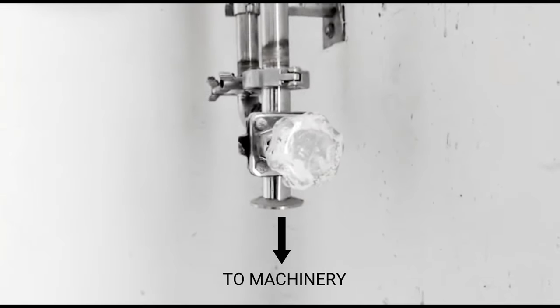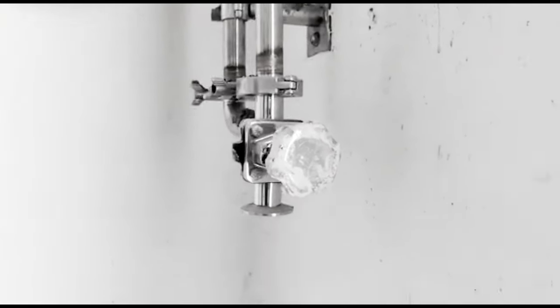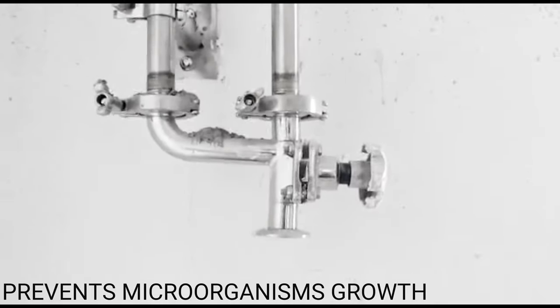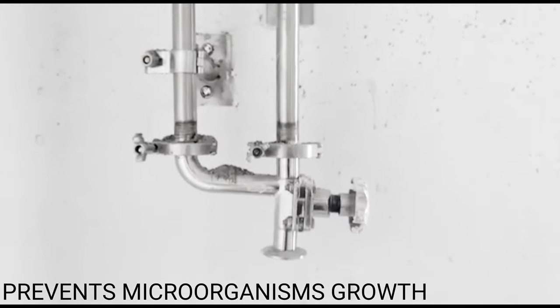The loop system is used so that water doesn't stop anywhere in between and is in continuous flow, so that there is no chance of microorganism growth in the water distribution system and proper pure water is supplied for the production purpose.